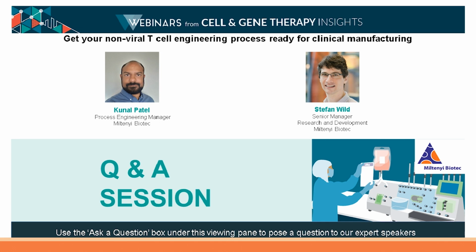I think the biggest challenge for most of the customers is to get the process GMP compliant. Typically the processes are well established on a research scale, and the scientific work invested at this point is usually huge. So there's a lot of knowledge at this development stage. They have well established small scale processes with a lot of manual handling. But if you have to do this routinely every day and also robustly so that you really can treat patients, the manual processes are most of the time not sufficient, or it would be too time consuming and too expensive.